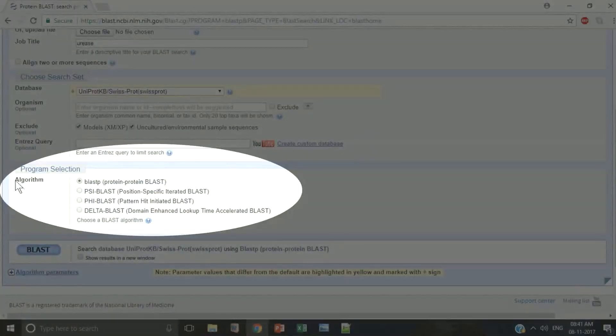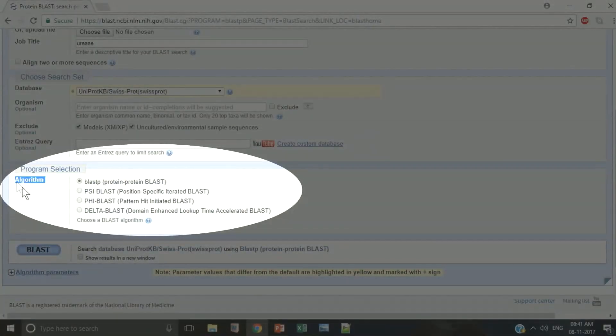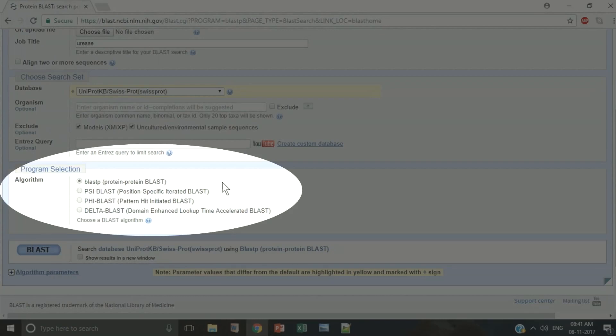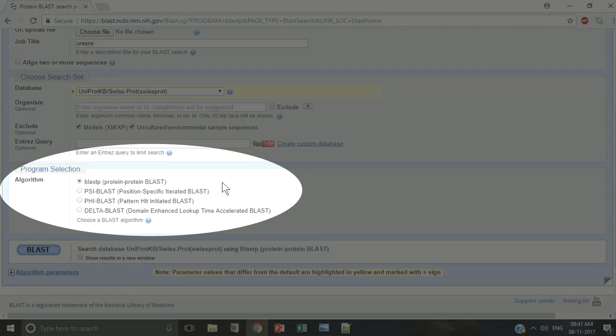Next step is to select the algorithm. See there are four major algorithms: BLASTP, PSIBLAST, PHIBLAST and DELTABLAST. Each of them are designed for BLAST searches with specific aims. We have prepared another excellent video on choosing a specific BLAST algorithm that you must watch to understand their differences.